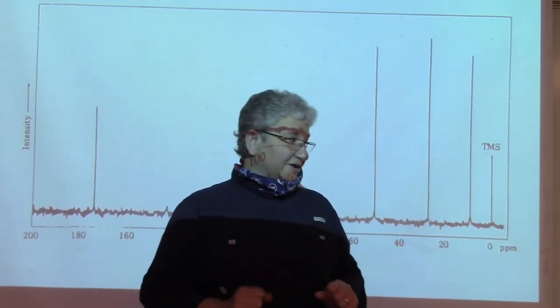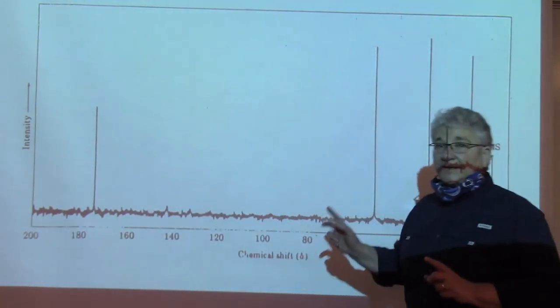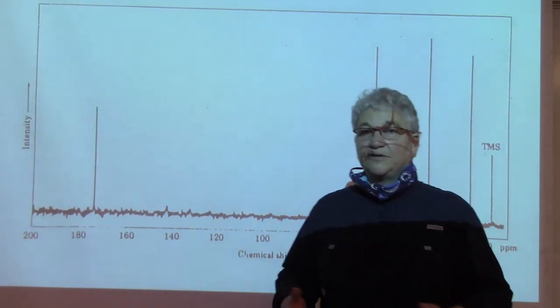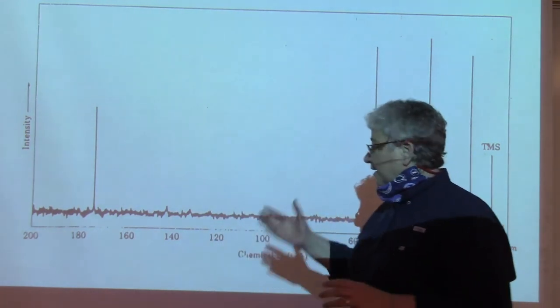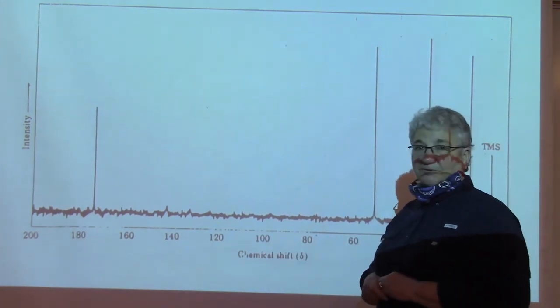But before we get to hydrogen NMR, let's start with carbon NMR, which is the picture that you see behind me. You have all of these pictures in your manual. I forgot to bring a manual down the hallway with me, so you'll have to flip through that yourself. But you have all of them in the very beginning of your manual, so you should be able to find them.